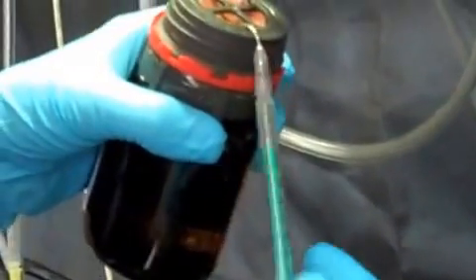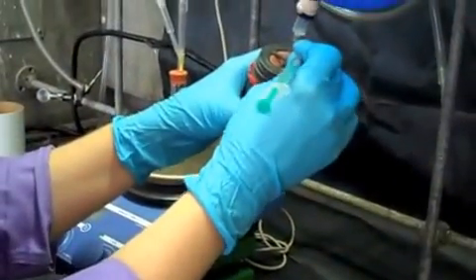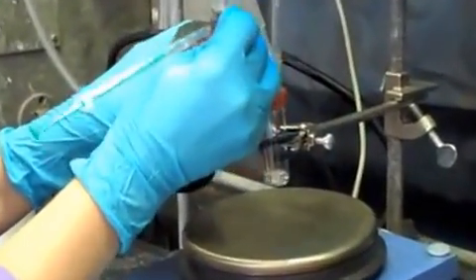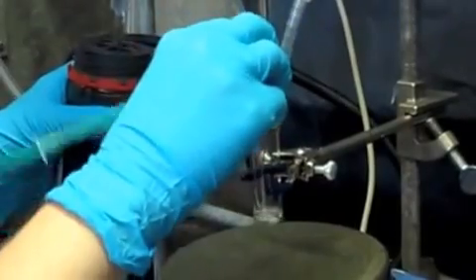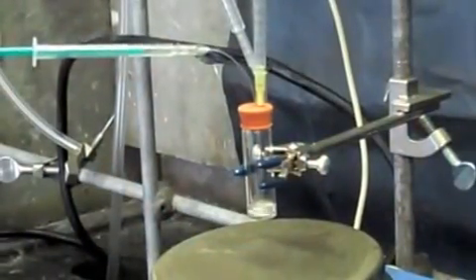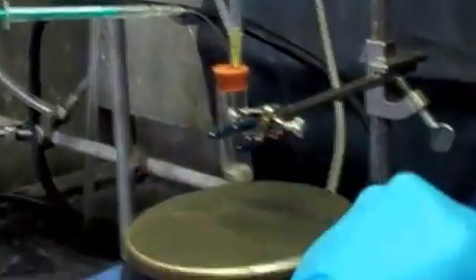I can push out most of the air and approximate that I do have indeed 0.3 mL. With argon left in the tip of the needle, I'll bring it close to my reaction flask and quickly pierce my septum. At this point, I'm going to take the balloon out of my n-butyllithium bottle and cap it tightly.